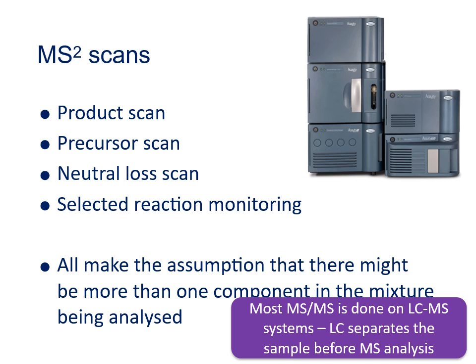And in the next session, we'll look at how the time relationship between LC and MS was the driving force behind the development of these 4 standard scans. But for now, let's go through the 4 of them in more detail.